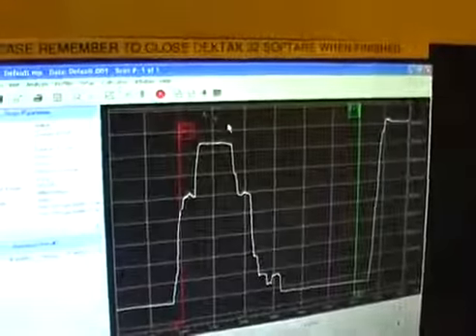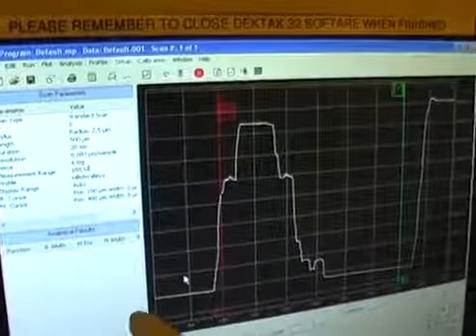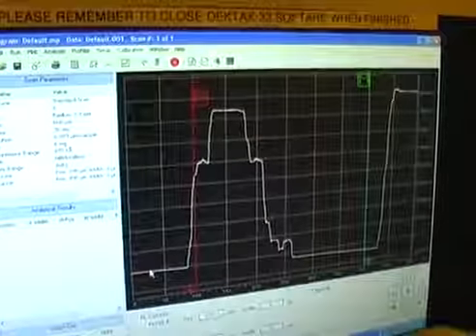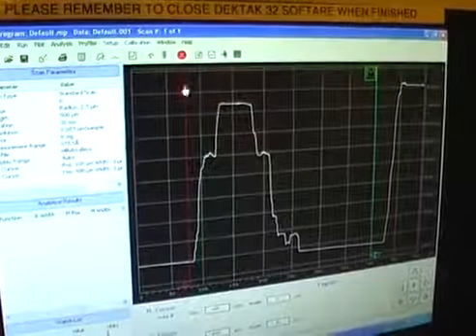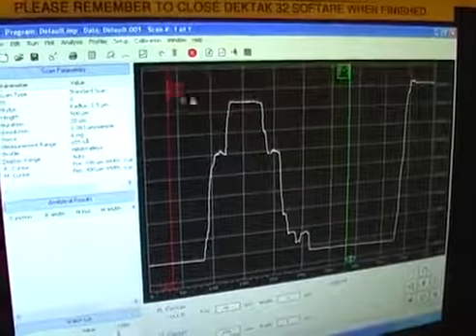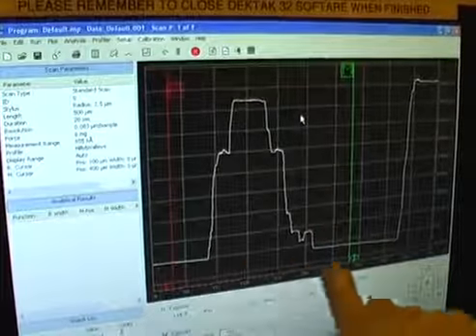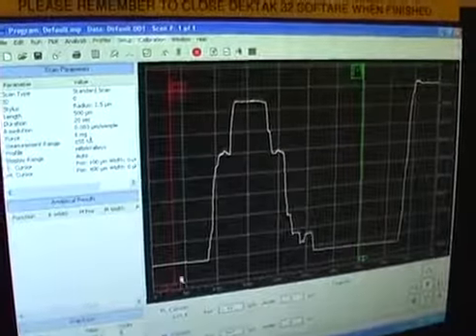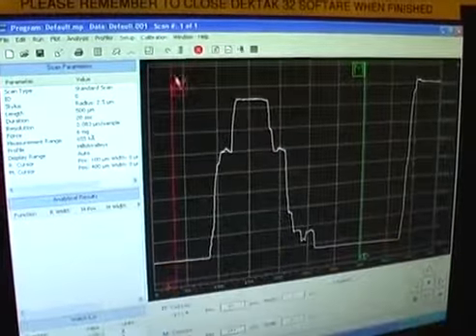Okay. After measurement, you will notice that even at the same surface, for example here and here, they're not at a horizontal level, so we need to tilt the data. For example, we set the two points. We know the two points are on the same surface of the sample, and we want to set these two points to be horizontal.